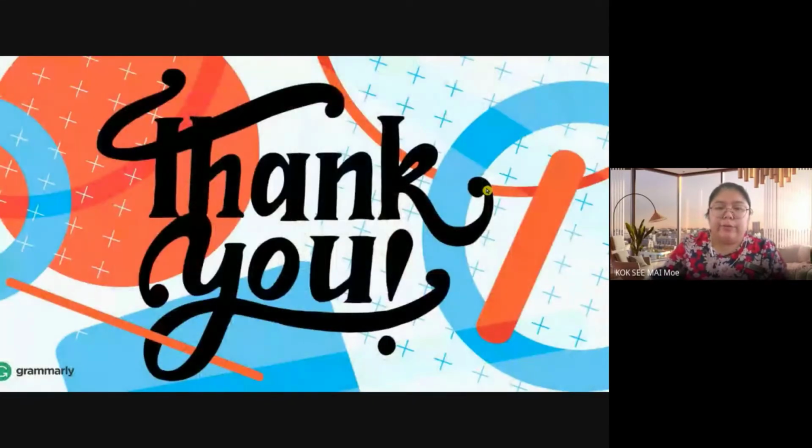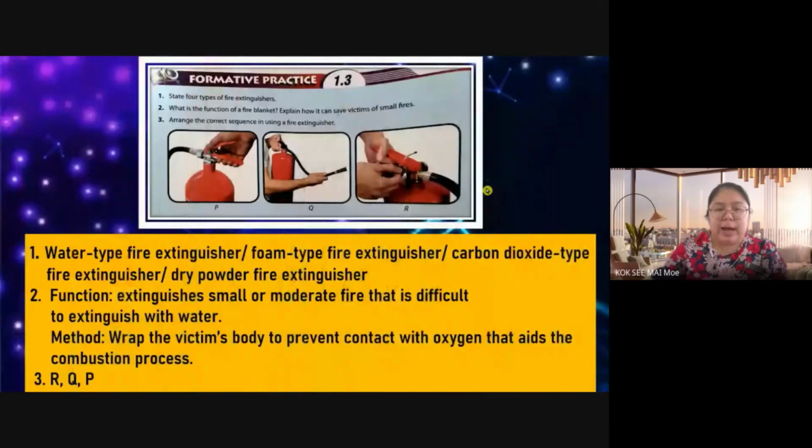So from here, I will show you the answer. Types of fire extinguishers. We got 4 types, is it? So you mention foam, then carbon dioxide, then you got powder. Then the function of the fire blanket, is it? What is the function of the fire blanket?